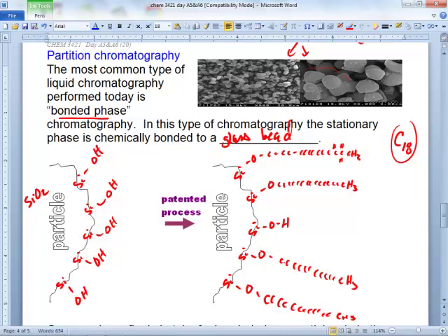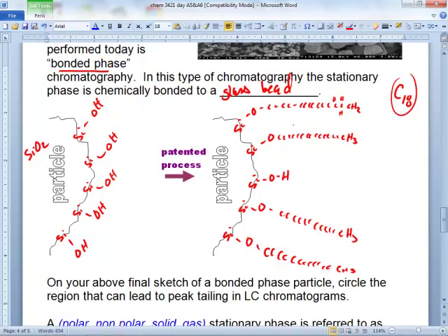Okay. Now, what's the question here? We want pretty peaks, nice, sharp, perfectly symmetric on both sides. But sometimes you can get some tailing. Let me show you what I mean by that. Right? And getting area under the curve, you saw that with the GC. Chromatograms are chromatograms. You're after the area under the curve. More area, more signal, more stuff. So this is more difficult to integrate with this tailing. And it'd be easier for things to co-elute and peaks to overlap.